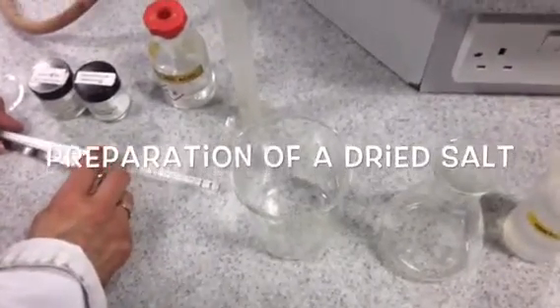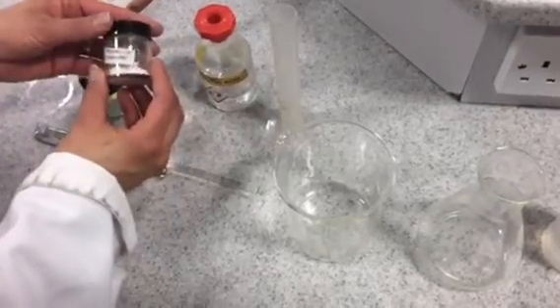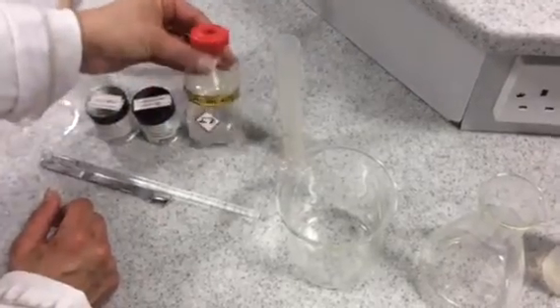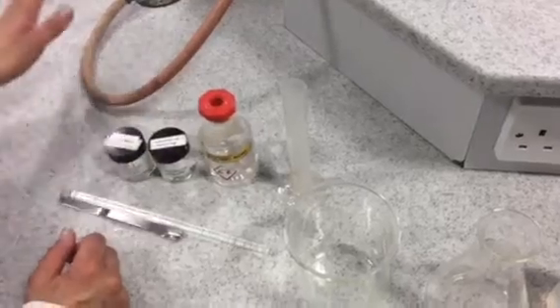Today we're making a dry salt sample. Salt is an ionic compound made from a base and an acid. The base we're going to use is magnesium carbonate and the acid is sulfuric acid. Make sure you're wearing aprons and goggles during the practical.